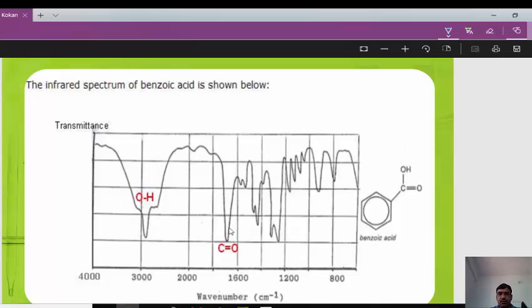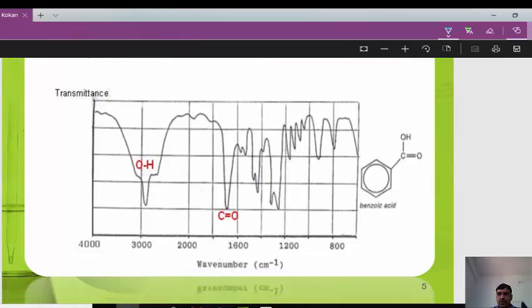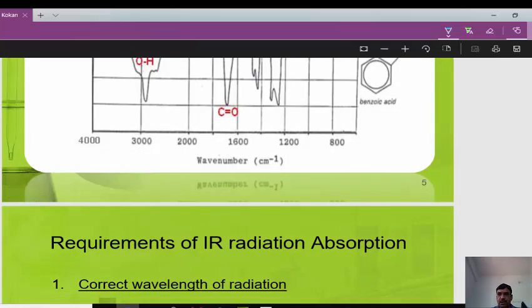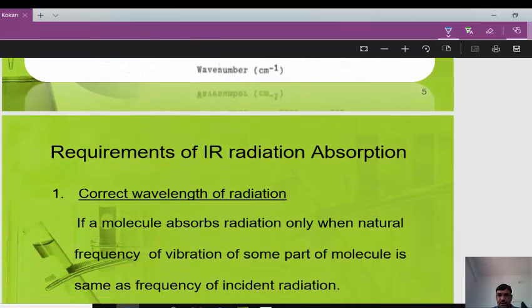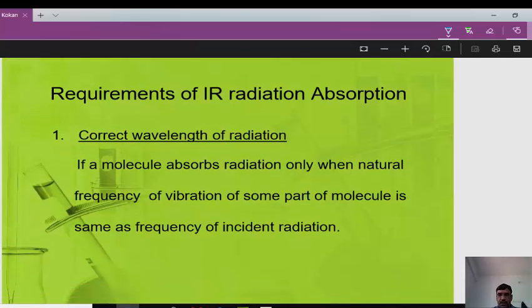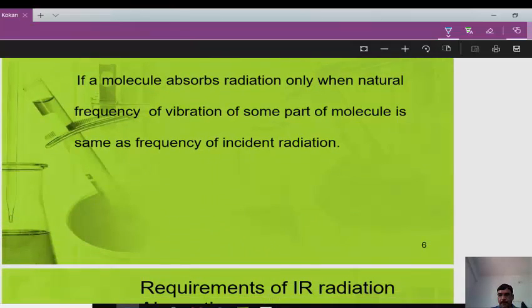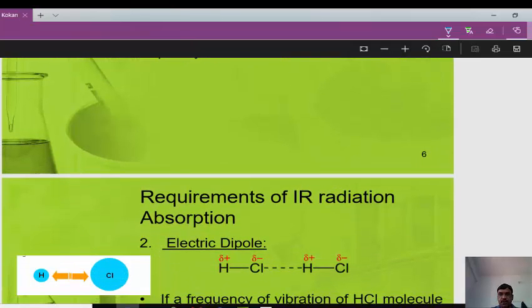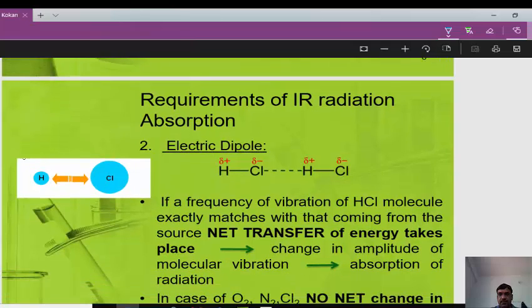Here we can see the IR spectrum of benzoic acid. Benzoic acid contains the COOH functional group, which includes both an OH group and a carbonyl group. The OH group shows a peak around 3200 per centimeter, and the carbonyl group absorption appears above 1600 per centimeter.